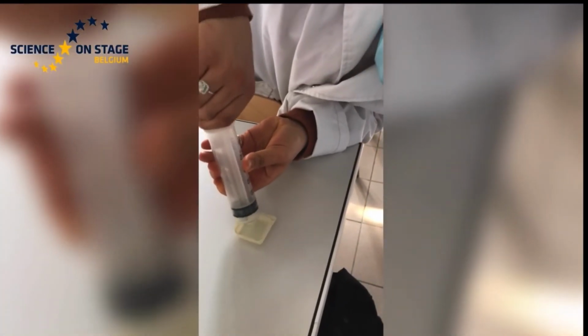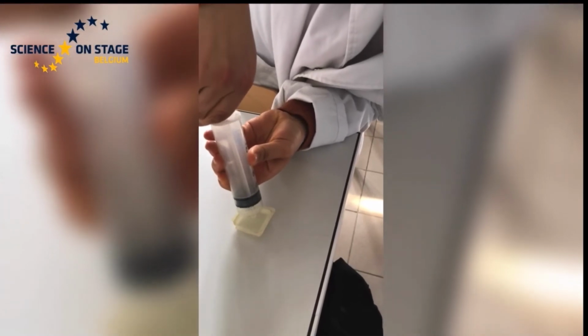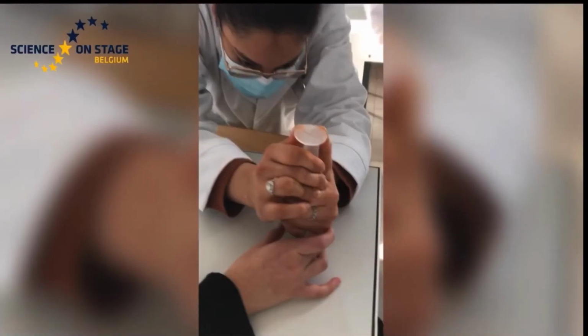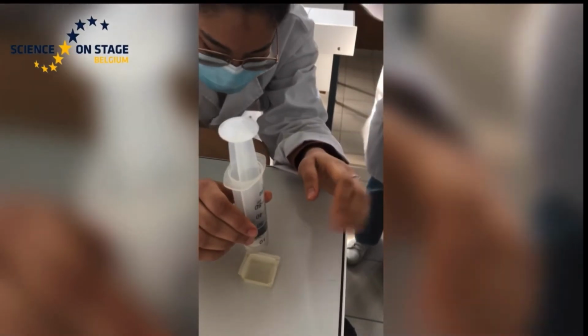We are going to suck up the liquid. This time it is 0.8 molar hydrogen peroxide. Again, try to take only the liquid but no air. Put the cap and invert the syringe. The solid catalyst, potassium iodide, meets the solution, which turns yellow.